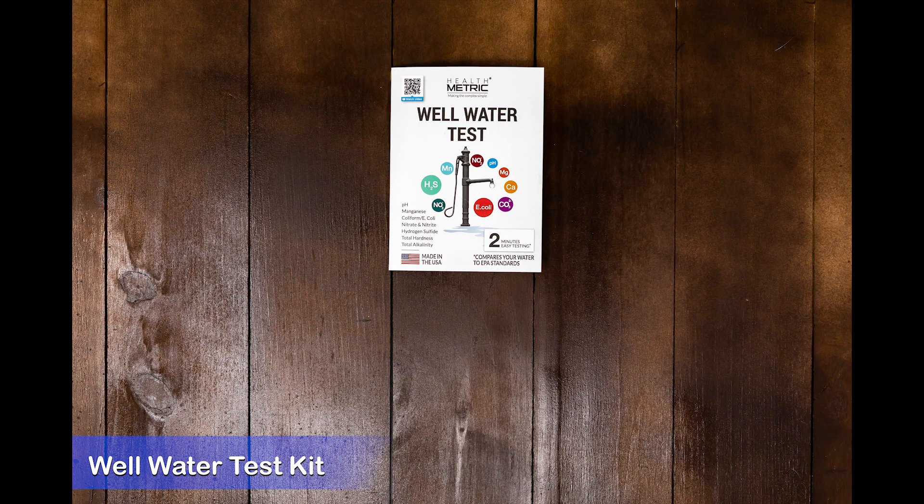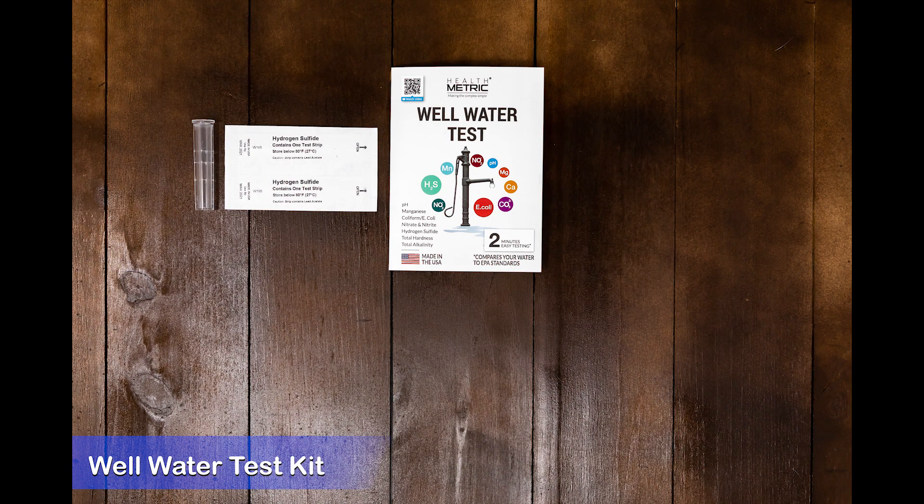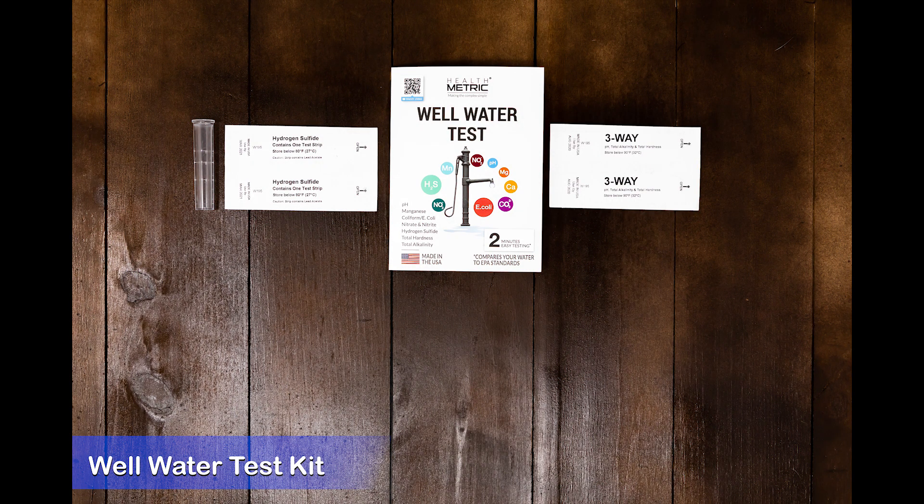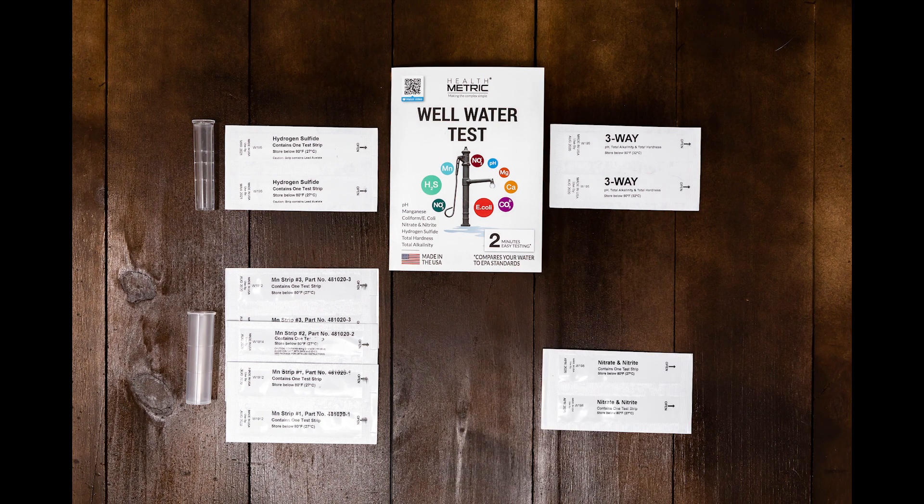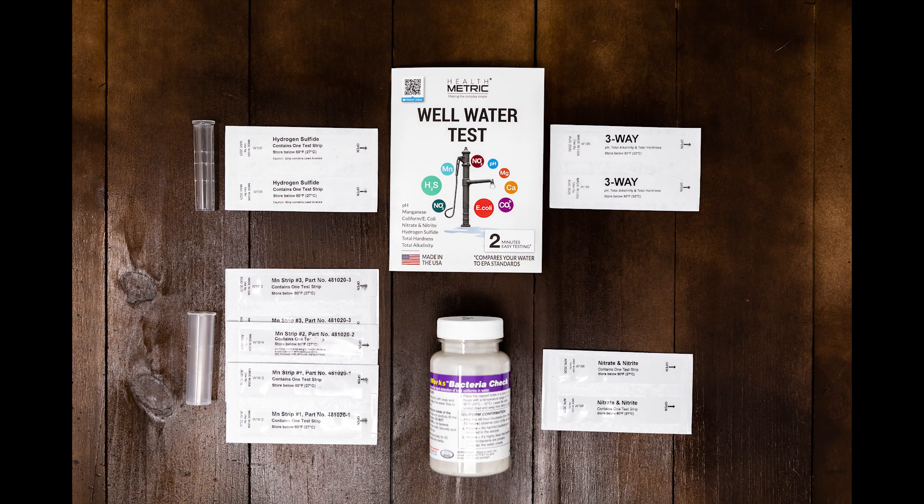The HealthMetric Well Water Test Kit contains two hydrogen sulfide tests, two three-way pH, alkalinity, and hardness tests, two manganese tests, two nitrate-nitrite tests, and one bacteria test.